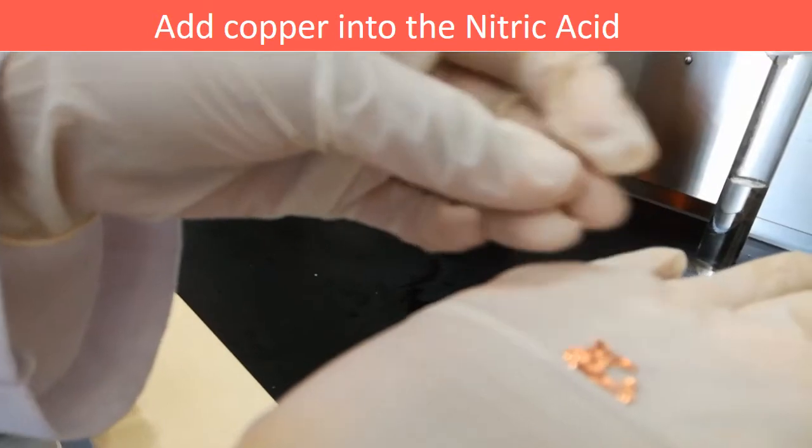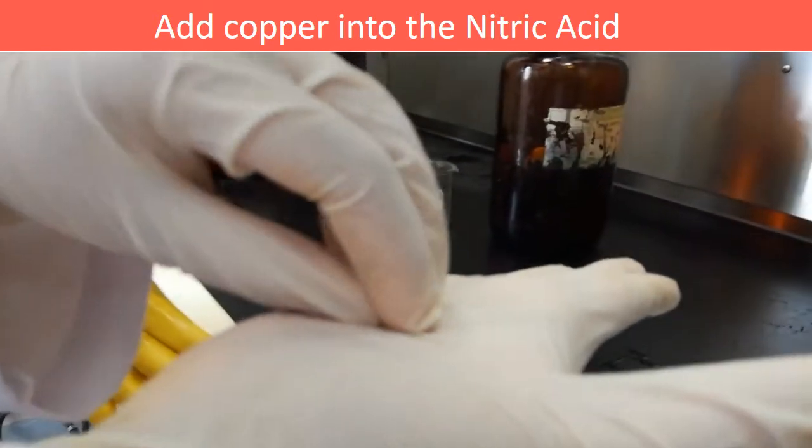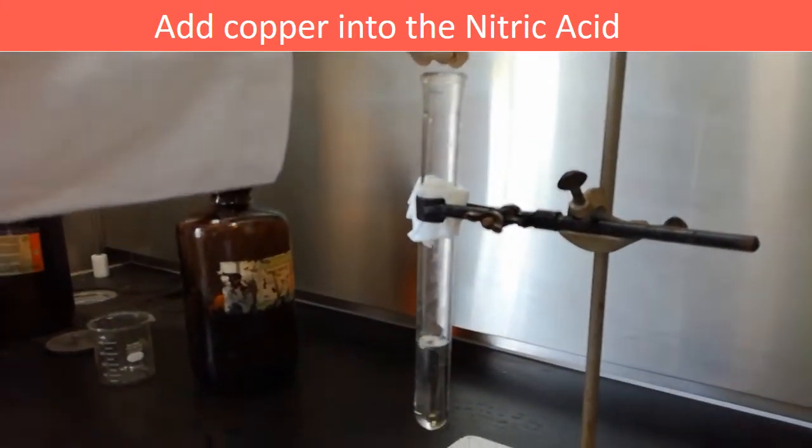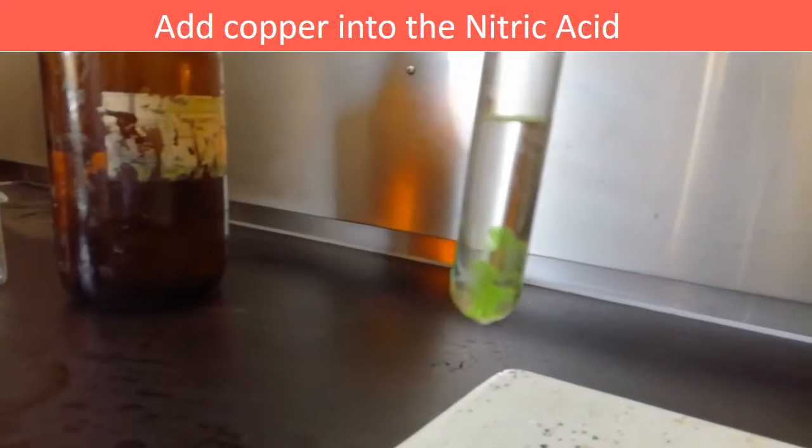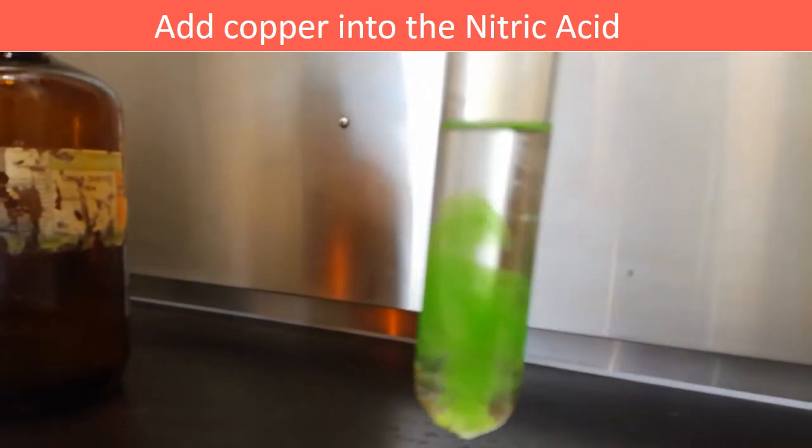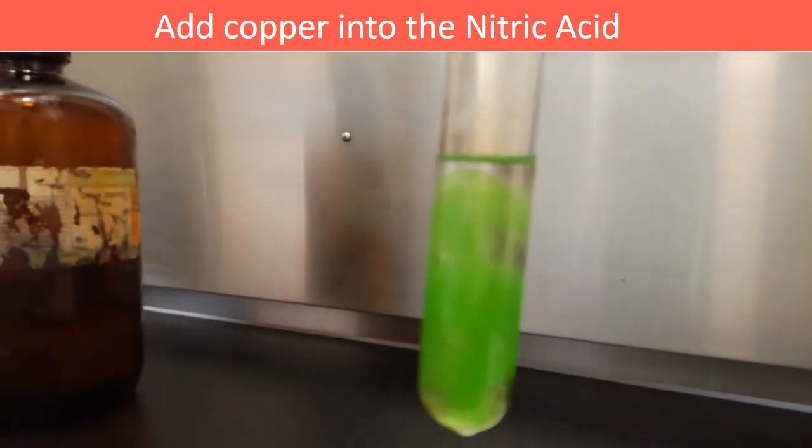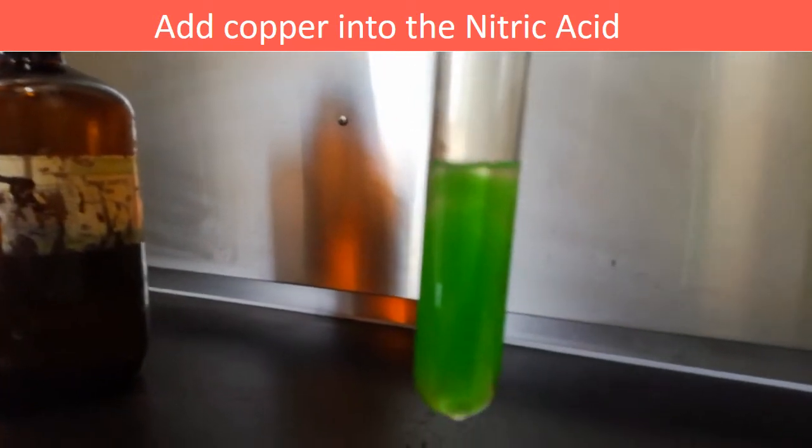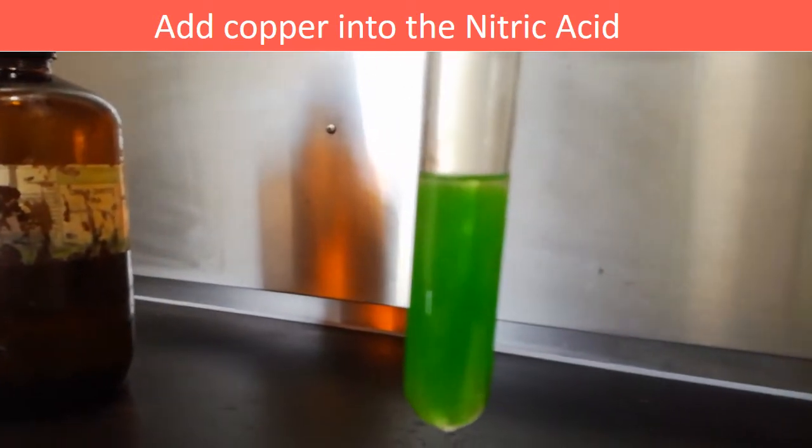From this reaction, brown color nitrogen dioxide gas is produced. Here we add some copper pieces into the nitric acid formed. We get to know whether the reaction is taking place when we add copper pieces into the test tube. The nitric acid is changed into green color.